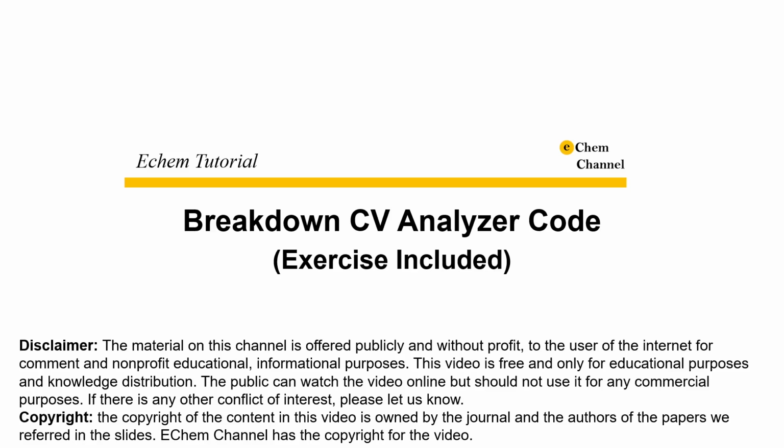This is John. Today we are going to break down the analysis code CV Analyzer that was used in the previous tutorial. I hope this will help you use this code with more confidence and have enough basic knowledge to create a program for your own project.